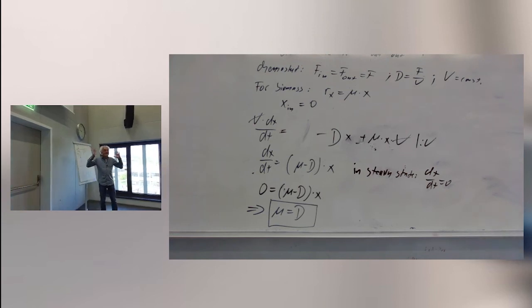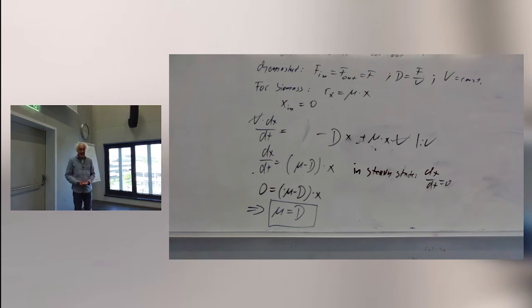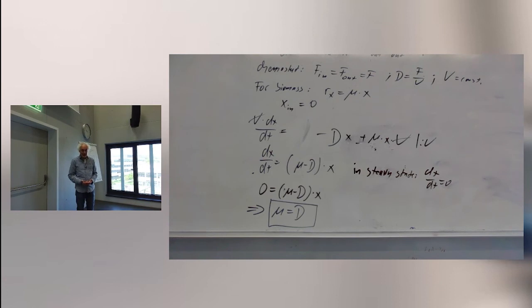So this means that to achieve that steady state, these microorganisms have to achieve that themselves. They are in this bioreactor, and they have to know what to do in order to come up to the steady state.